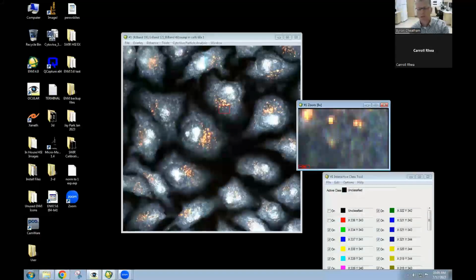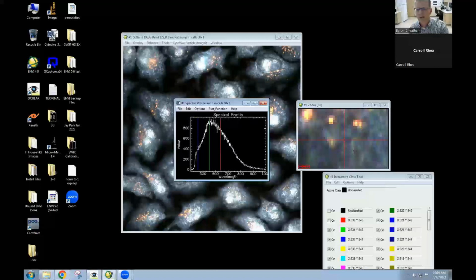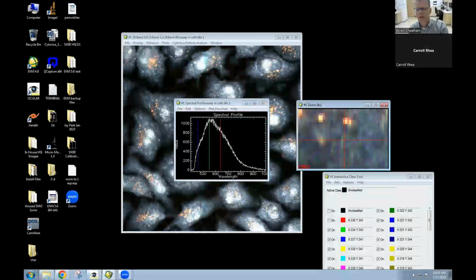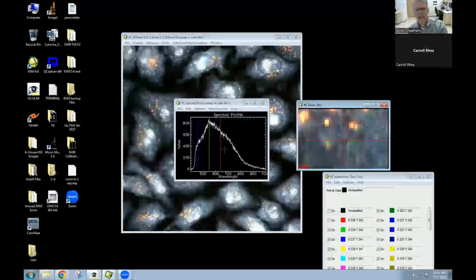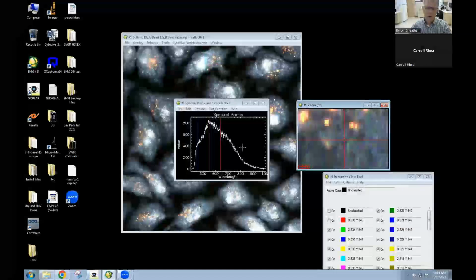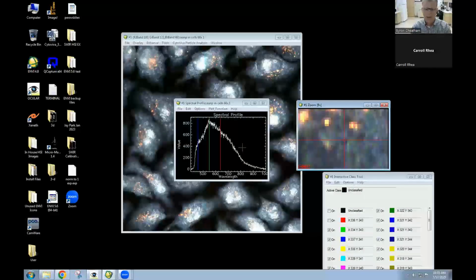And to demonstrate this, I'm going to right click in this box. So here is the Z profile, its spectrum. And I'm on a tissue area here, a cell structure area here. And as you see, as I move around, there's some change in the actual spectral profile. There are slight nuanced differences in this cell from pixel area to pixel area. And just for reference, the pixel sizes here are about 240 nanometers, 0.24 microns in size.